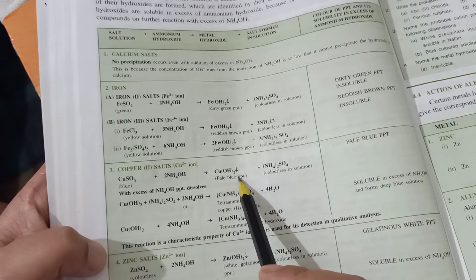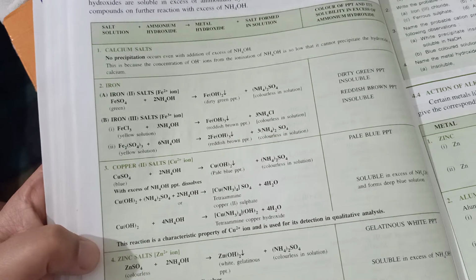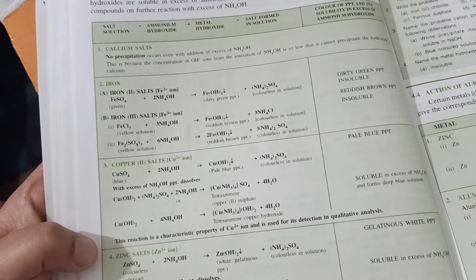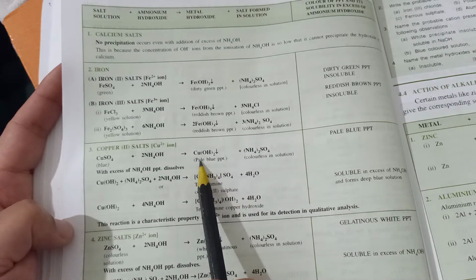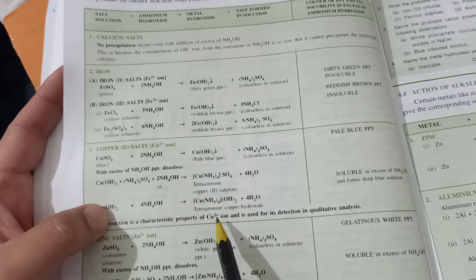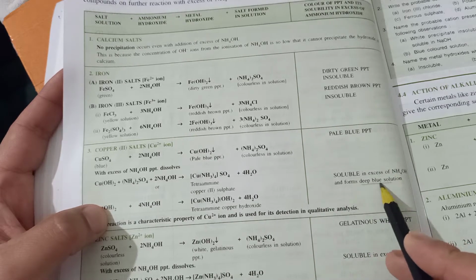Now this pale blue precipitate, on further treatment with excess amount of ammonium hydroxide, forms a soluble substance. That means it is soluble in excess amount of ammonium hydroxide. And this copper 2 hydroxide, when treated with excess amount of ammonium hydroxide, dissolves to produce a copper ammonium complex salt, which is deep blue in color.